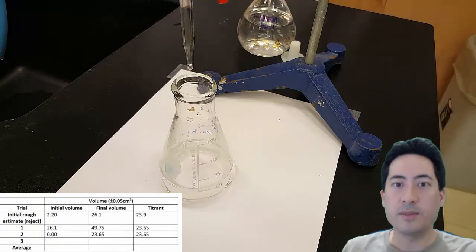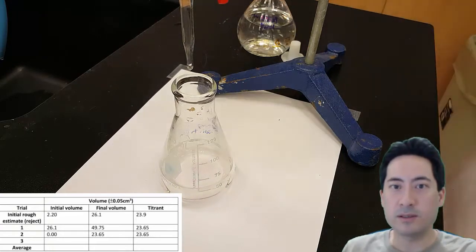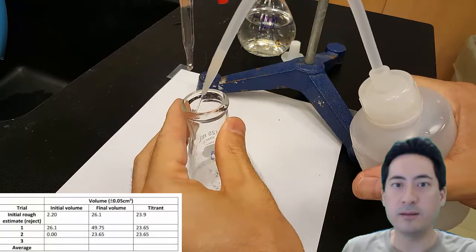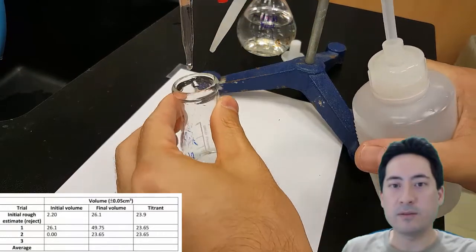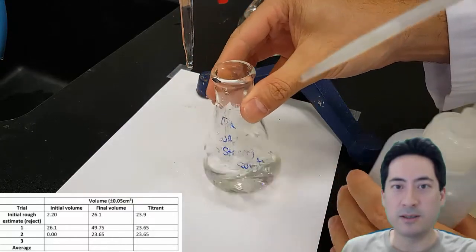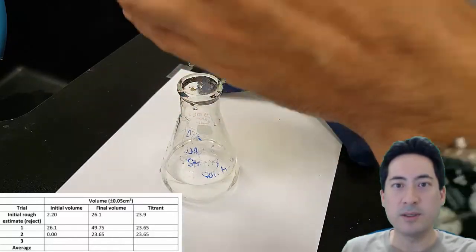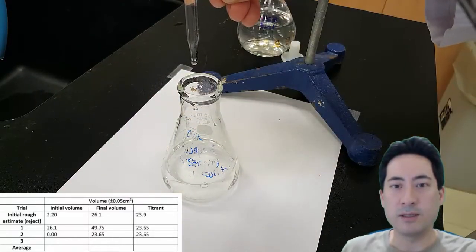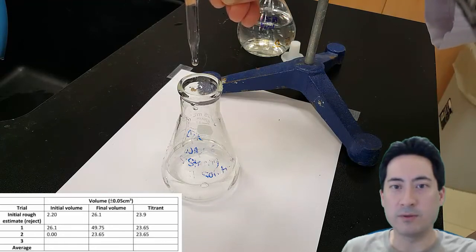And what I'm doing here is I'm getting the water bottle and I'm rinsing the sides of the conical flask and the tip of the burette. That's to make sure I get every single particle. So if there's been any splashes on the sides or any attachment of the drop to the tip, I can wash that all together right down into the solution to make sure they're fully mixed.